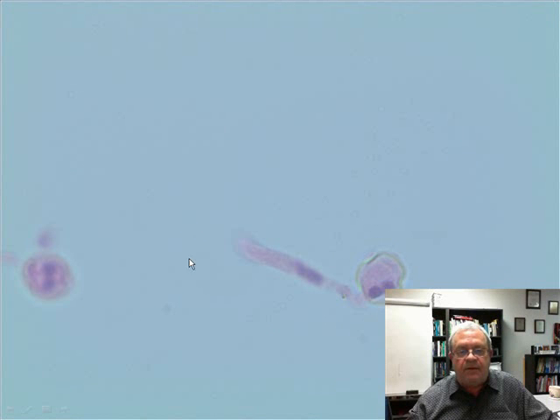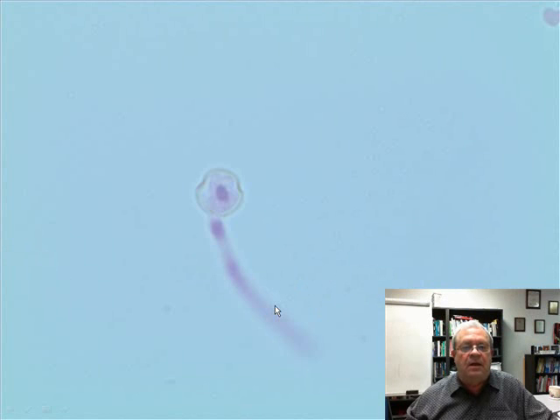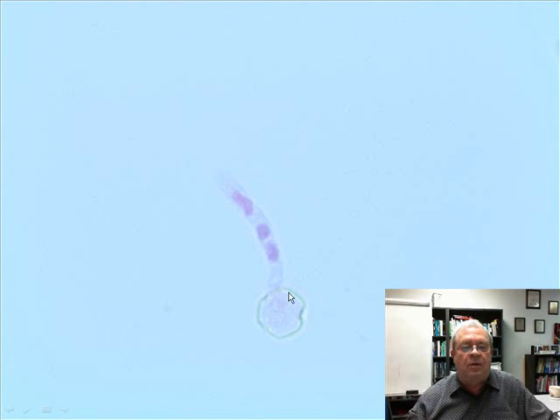What do we have here with this pollen grain and its pollen tube? We have two objects still in the pollen grain proper, and one has left the pollen grain and entered the pollen tube down here. Again, our 1, 2, 3 objects, first in the pollen grain, then in the pollen tube. Here's one still in the pollen grain, and here's one, and it's a little blurry, but there's the other one in the pollen tube. And so, what's going on here?